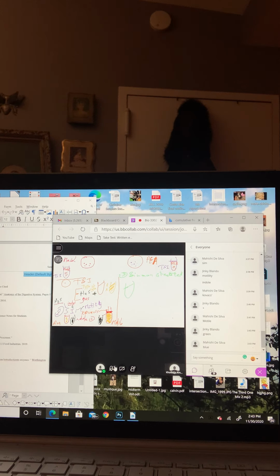After incubation, if your tube turns blue, it means citrate positive, because the bacteria turn the medium blue under this condition. So it's positive. The most important use of this test is to identify which kind of bacteria.